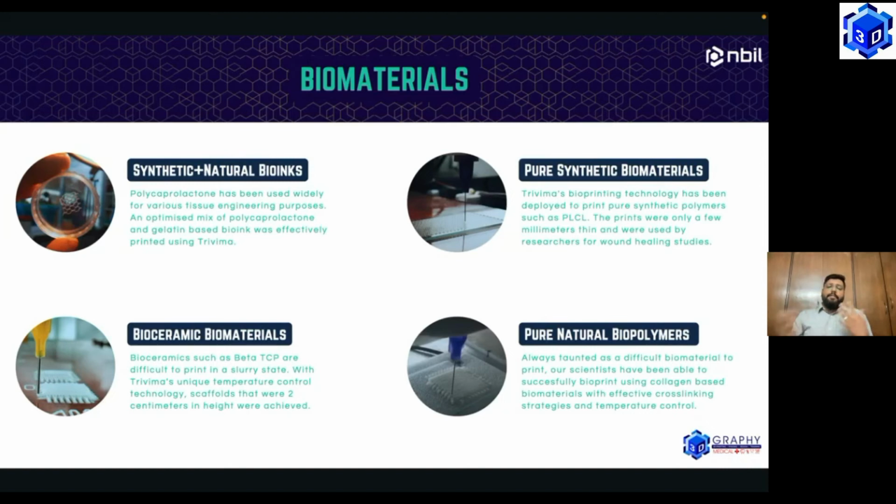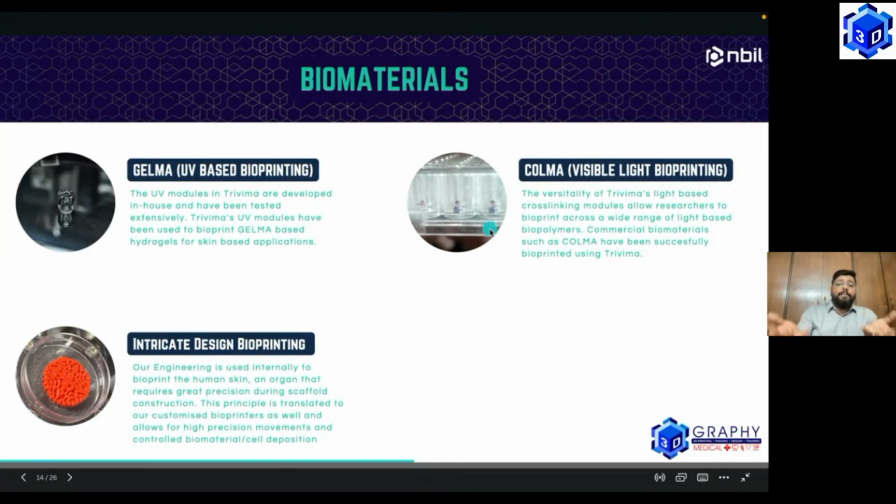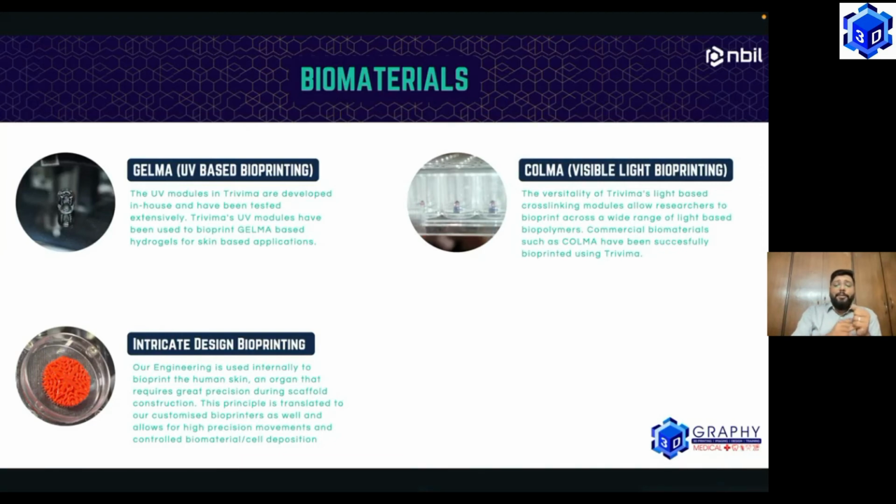And then obviously we had different polymers that we were utilizing for skin and testing for skin, that we had printed using this. Over the period of time, we were able to also print with light-based polymers, where you have UV-based, as well as here in the Merck project, visible light-based printing. So we pretty much had to print in a dark room. And it was very difficult, but yes, we somehow managed the droplet based printing there. And then obviously when you're looking at optimizing the bioprints, that's another key factor here.